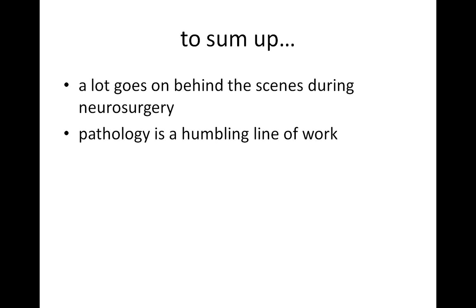And I have no hesitation about enlisting the help of colleagues either here at the University of Kentucky. We're a very collegial group of neuropathologists. So if we don't see something we're comfortable with, we'll send it to somebody else to get a second opinion. All going on behind the scenes, the patient never knows what's going on.